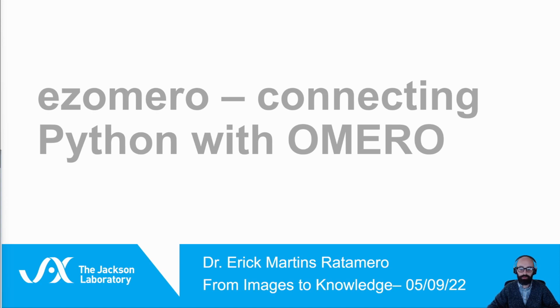I tried to do a good job at describing all possible scenarios you might be finding yourself in and how to set up everything so that you can go through this workshop. I encourage everyone to follow along, actually writing the commands I'm going to be writing, seeing the results on your computer. To do that, you are going to need a Python environment that has ezomero, and you will need access to an OMERO server. The setup guide goes into detail on how to get these things together.